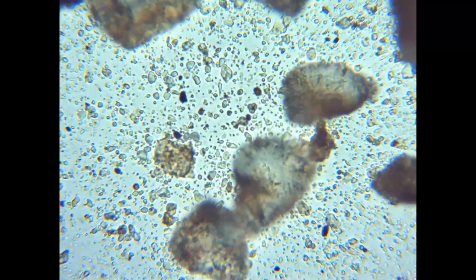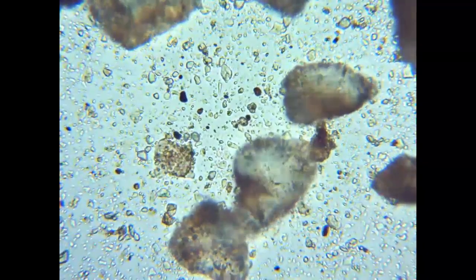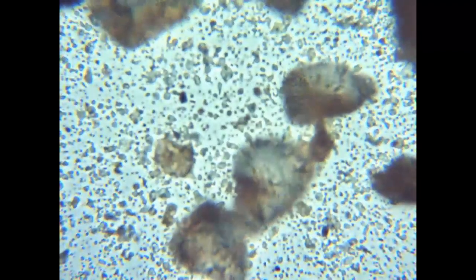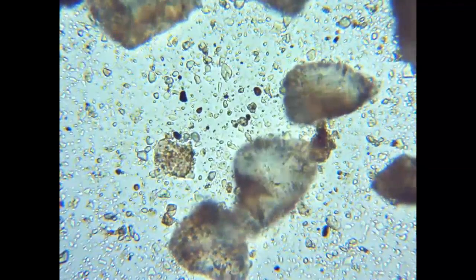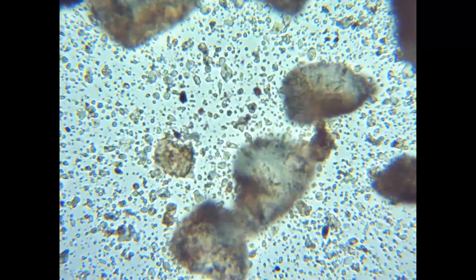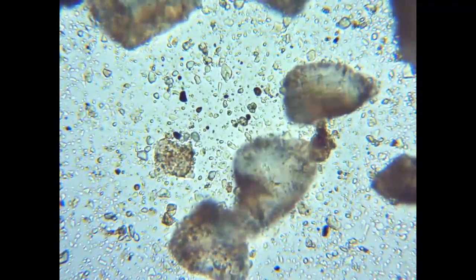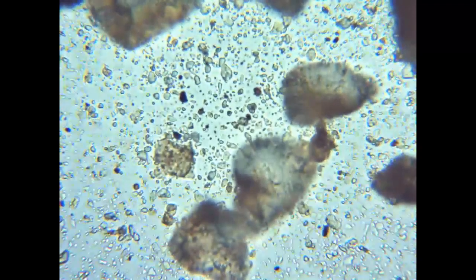For the rest of the assessment, you will want to go up to 400x total magnification. The first thing you'll notice on almost every sample is bacteria. They're very, very small — almost dots on the screen. If you look real close, you might see they come in different shapes: there are spheres, rods, and little oblong tablets. They are about one micrometer across and can sometimes be mistaken for a little clay granule. But you will see them moving around quite a bit.